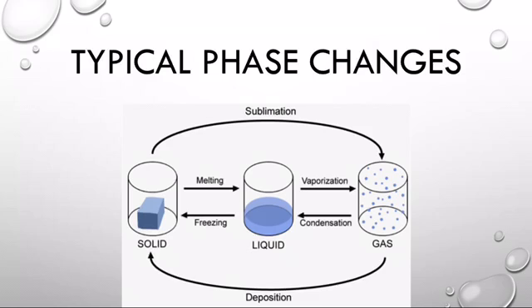So in our third way, we are going to dip the tip of a piece of ice and see what happens.